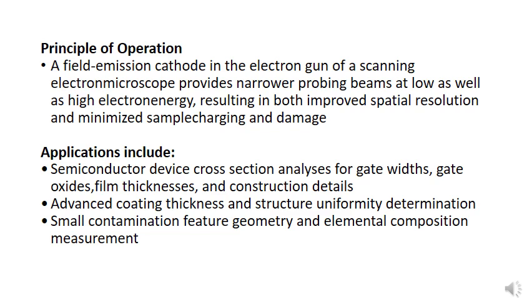So what is the application for FSEM? We can use it on semiconductor samples or semiconductor devices to study the cross-section of the semiconductor. And after that, we also can learn about the advanced coating thickness, to see whether it is uniform or non-uniform, determination. And then we can also investigate the small contamination, feature geometry, and elemental composition measurement. For the elemental composition measurement, just like what I said just now, you need to equip your SEM with the EDX. So EDX can give you information about the elemental composition.